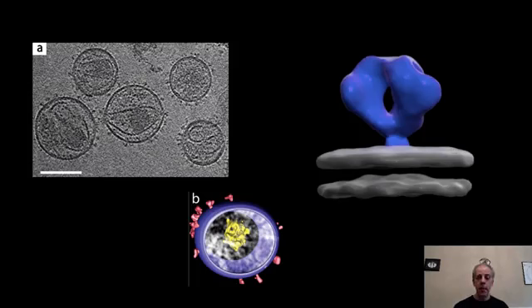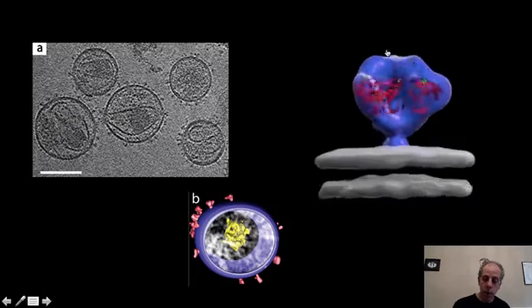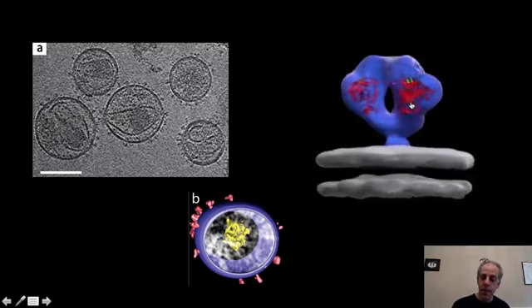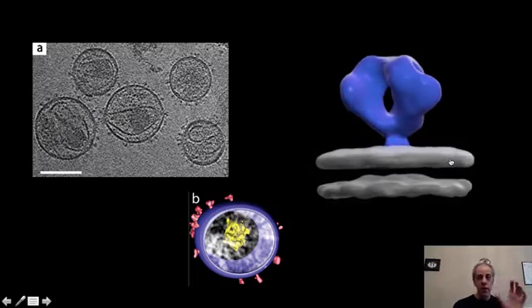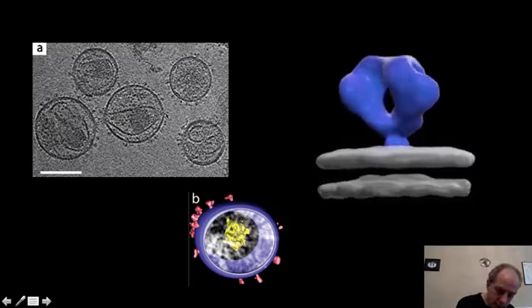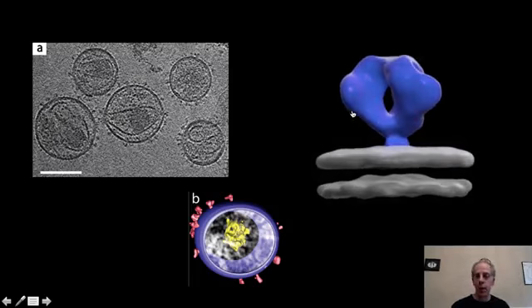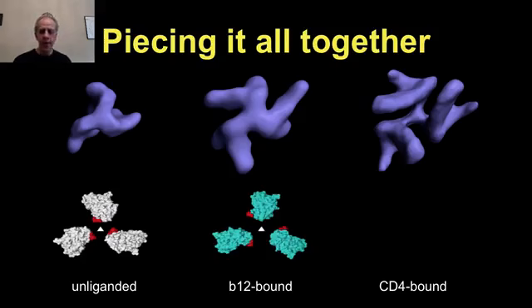You have the membrane that you were expecting, and I'm going to just run this video. And this is the shape. This is the envelope that you were looking for. And then you try to fit pieces that for other reasons are known, and you see, oh, this is one of my validations. Nobody has seen this in its entire composition, but they have seen pieces of it. So let's just try to bring them and see if we can fit them properly. So this is the envelope that you see here. How did you get from here to here? Smart image processing. Once you have done that, you can start doing the biology.